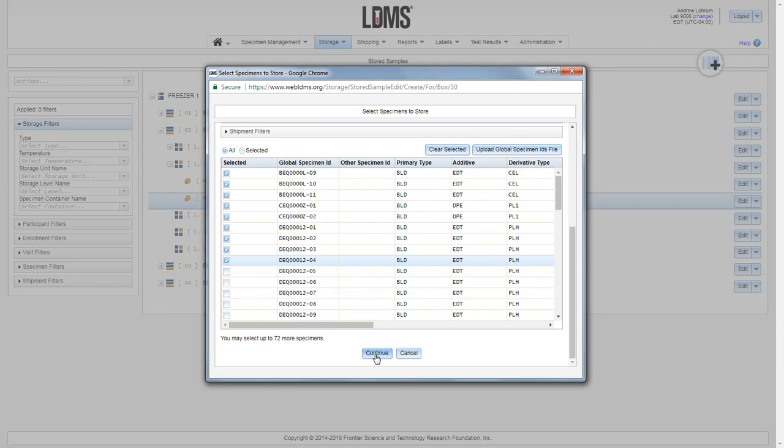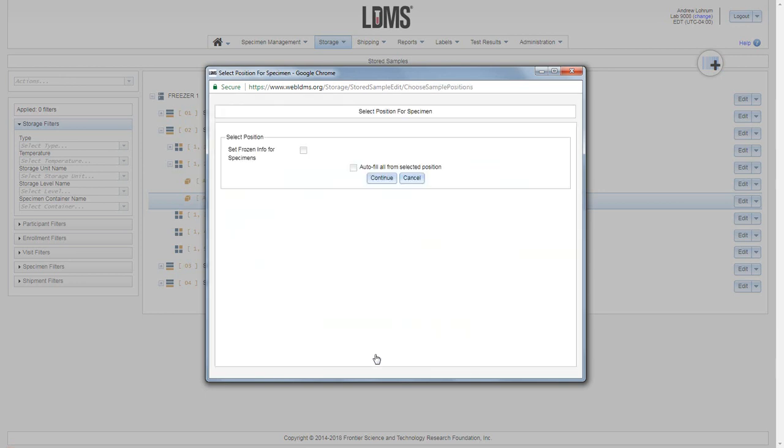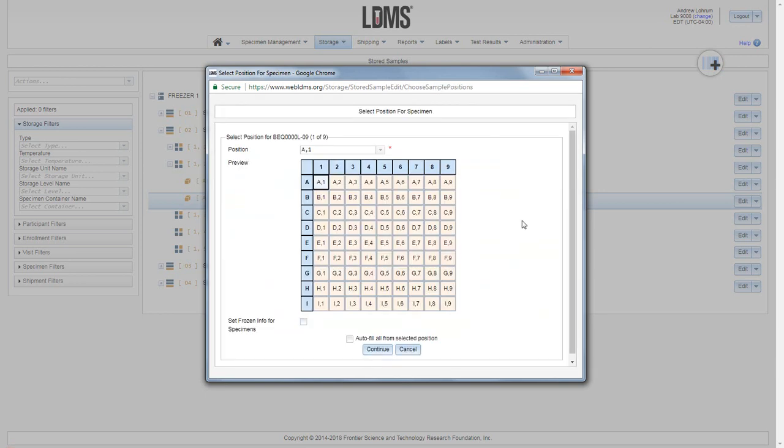Once you have selected all of your specimens you wish to add at this time, click continue and then you will assign them a position within the container. A 2D representation of the container is in the center of the menu.